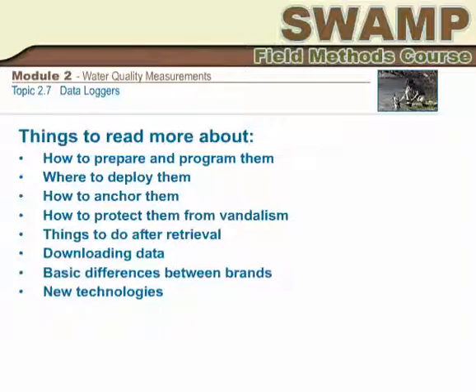There are many SWAMPers out there who would be happy to share information about the items listed on your screen. If you have a YSI sonde, you can view the PowerPoint presentation on your CD, as prepared by Peter Otis for his training class. Contact RB3 for information about Hydrolab sondes and deployment durations. And always look out for new technologies, such as a miraculous dissolved oxygen probe that never requires maintenance.